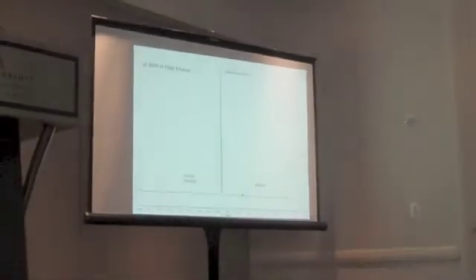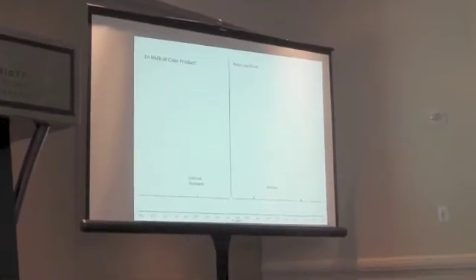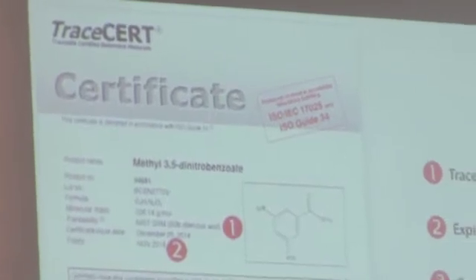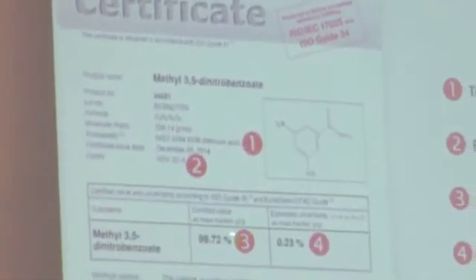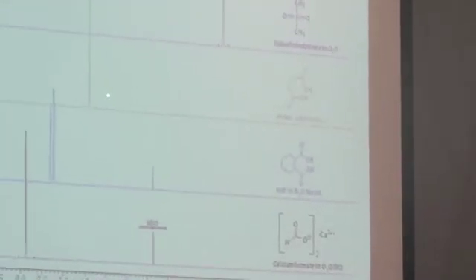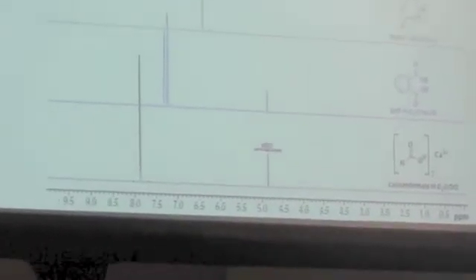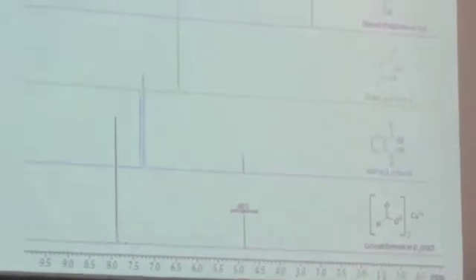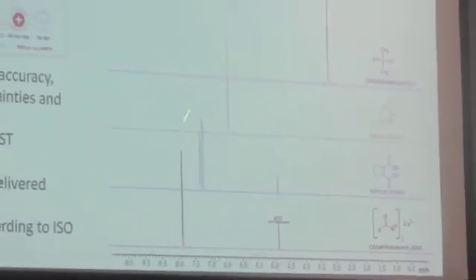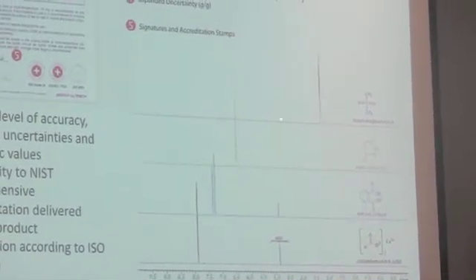So if you look at a cider, what do you see? When you first look at it, you've got this internal standard. What I wanted to say about this is you can buy standards from a chemical company like Sigma Aldrich, and they'll give you an ultra pure internal standard. I usually use maleic acid, which is this guy. It has 2 hydrogens that are identical to each other on this molecule, and they show up at like 6.4 ppm, always in the same place, and it's kind of out of the way of all the chemistry I'm interested in, like all the sugars and the organic acids and things like that. So you use that because it's not going to interfere, but it's nice and easy.